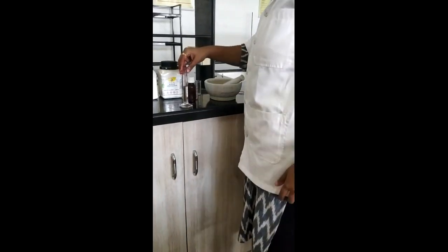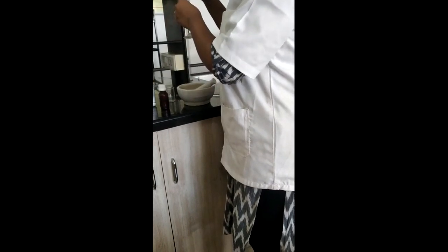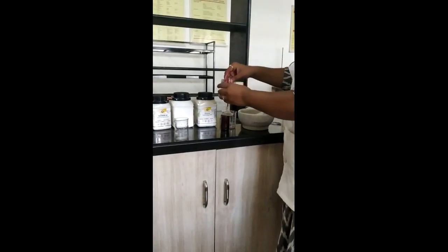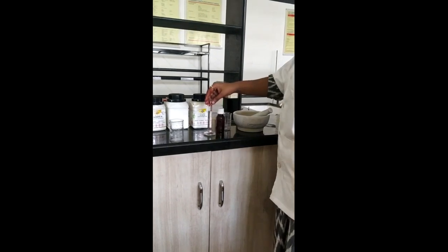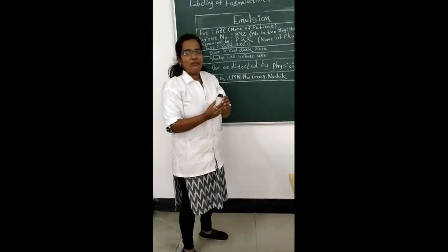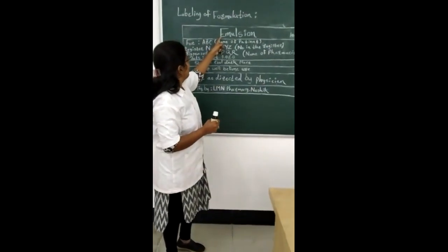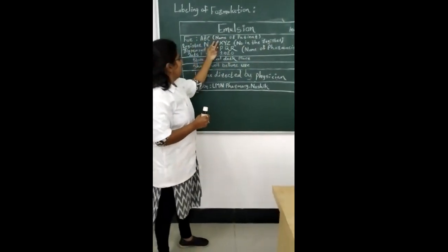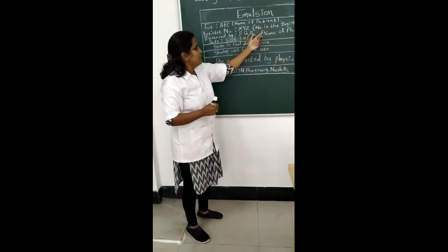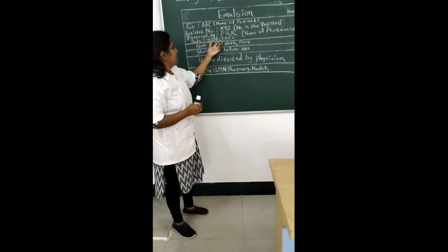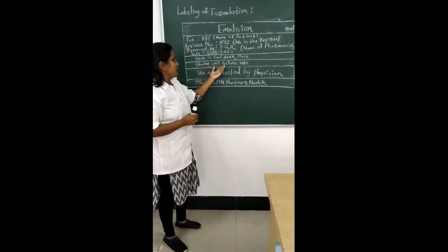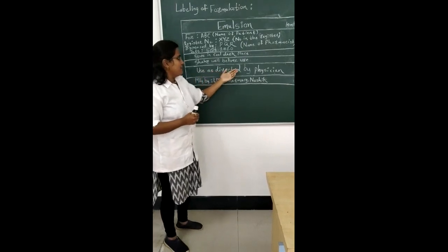After proper trituration, the emulsion is poured into a measuring cylinder and the volume is made up to 10 ml with cinnamon water. After volume makeup, the emulsion is transferred into a container. The labeling of the formulation: emulsion 10 ml, patient name ABC, register number XYZ, dispensed by pharmacist's name, manufacturing date September 2020, storage condition: store in a cool and dry place, direction: shake well before use, use as directed by physician.